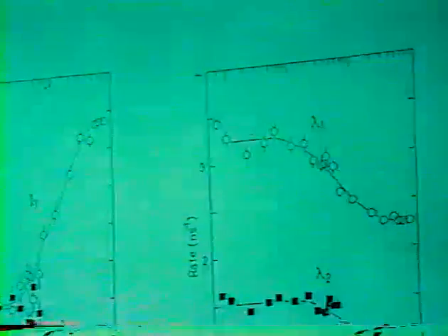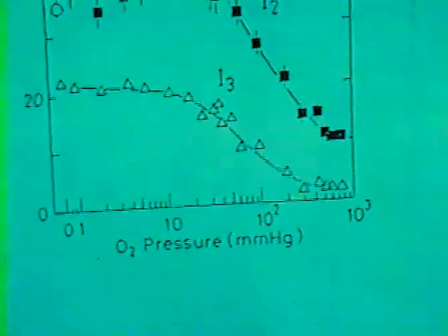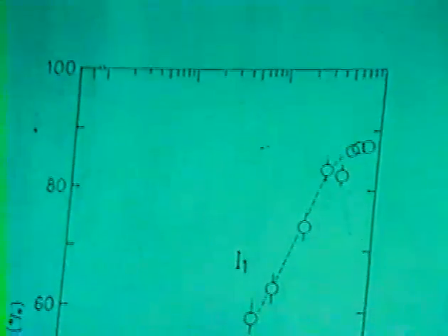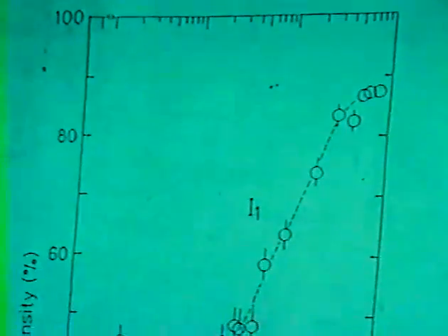The first component is background plus parapositronium lifetime component, the second is a positronium lifetime component, and the third component is also a positronium lifetime component.